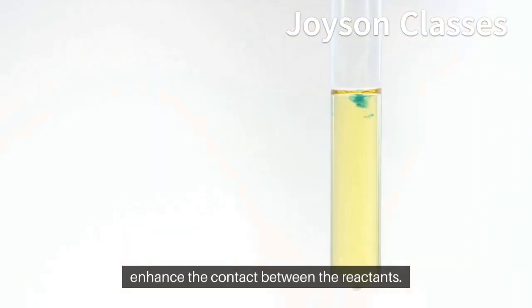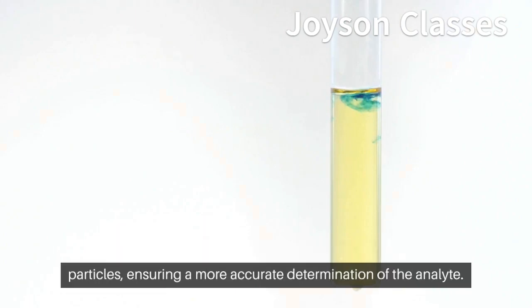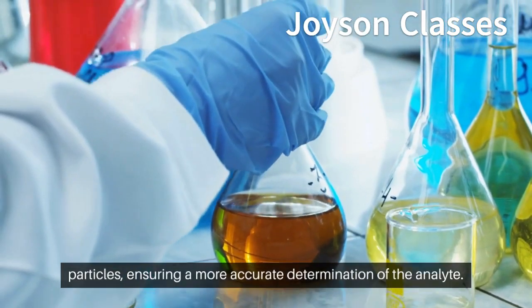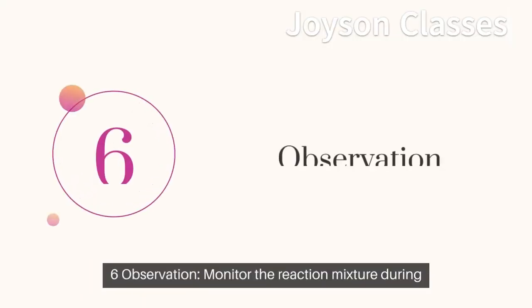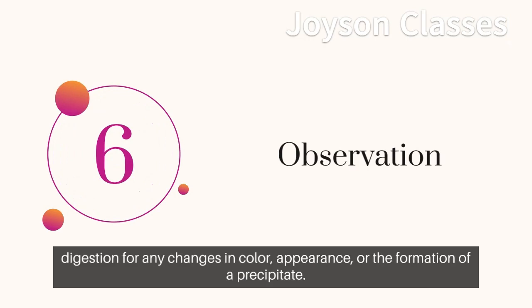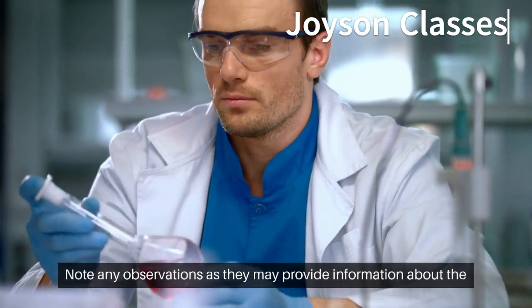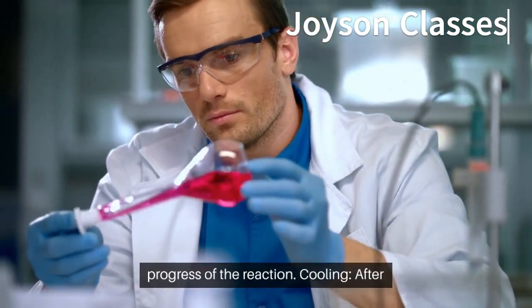reactants. The stirring prevents the formation of unevenly sized or agglomerated particles, ensuring a more accurate determination of the analyte. 6. Observation. Monitor the reaction mixture during digestion for any changes in color, appearance, or the formation of a precipitate. Note any observations as they may provide information about the progress of the reaction.